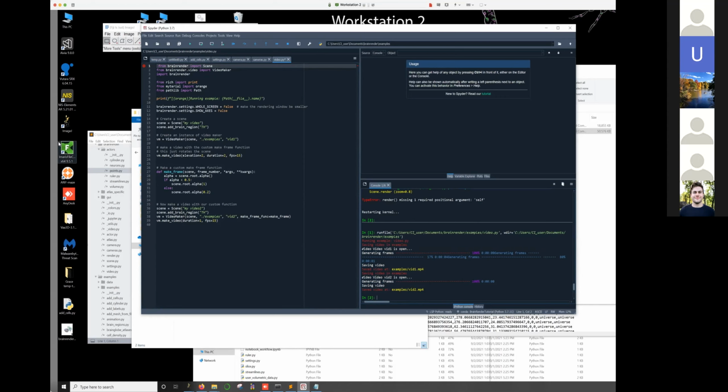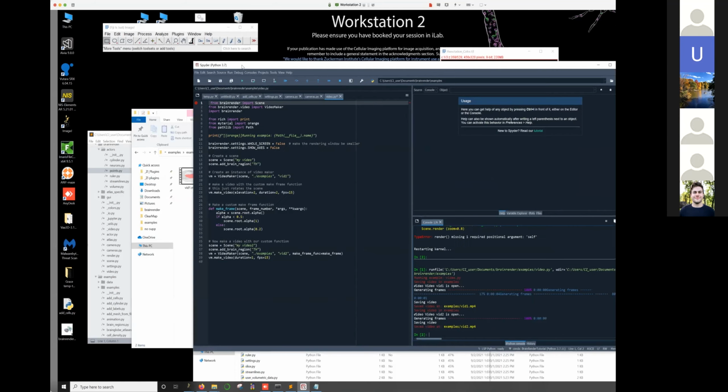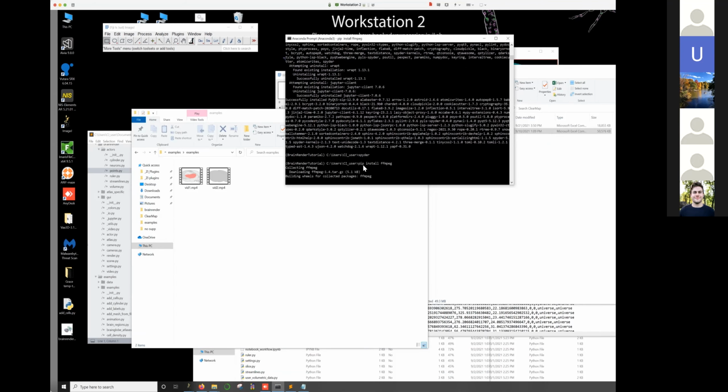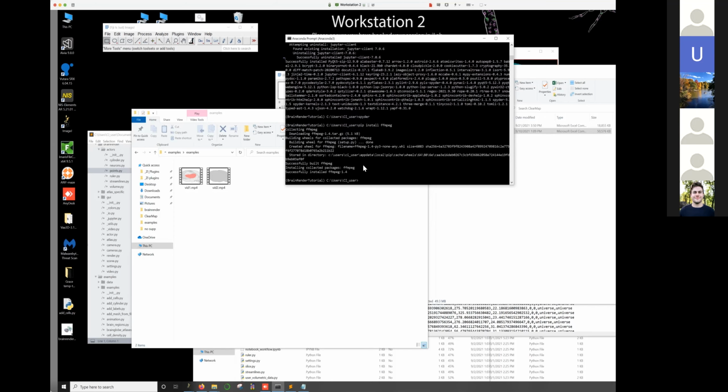So yeah, this is kind of a pain, and if you're not used to doing these things, it could put you off using this tool, but it's actually pretty easy to fix. I can take you through the steps to do that. If you close out of Spyder, the first thing you might try is to pip install this program. This is basically the program that can generate these movie files. It's a very quick installation, but it still won't completely solve the problem. You need to actually download this application and install it, and add it to the path. I can show you those steps now.